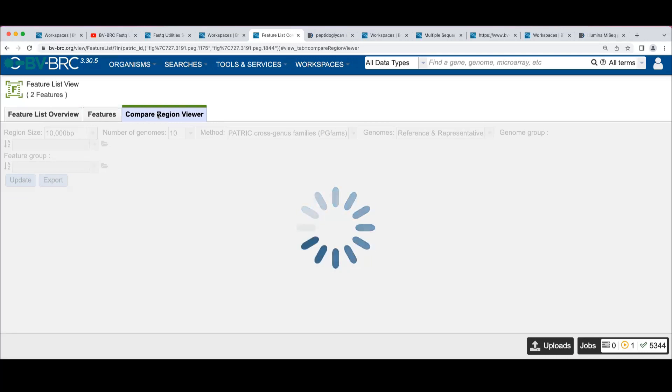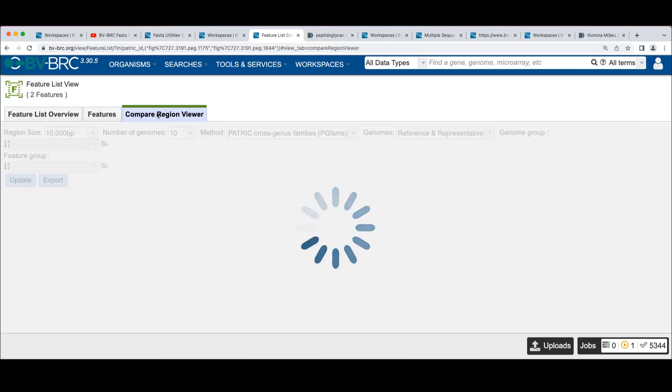Because remember, this is the two features that are in the genome, where we expected there to only be one. Do you have any questions while this is grinding away?